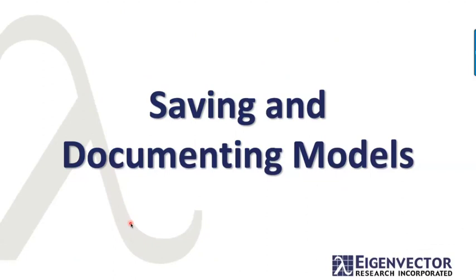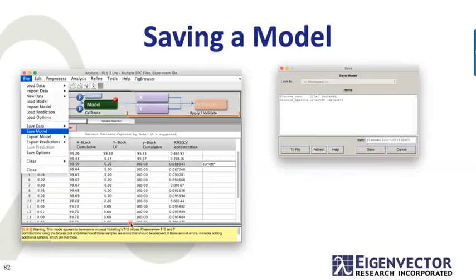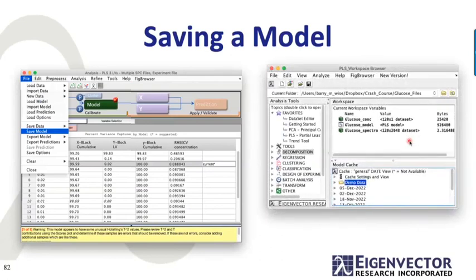Saving and documenting models. Saving a model, we just go from the file menu and say save model, and it'll come up with a name for the model, PLS model, and give it a date and time stamp. And so you can call it that, or you can call it something that you like, glucose model. If you save that with glucose model, it'll show up in your workspace with this icon here as a model, and it'll say that it's a PLS model right over here.